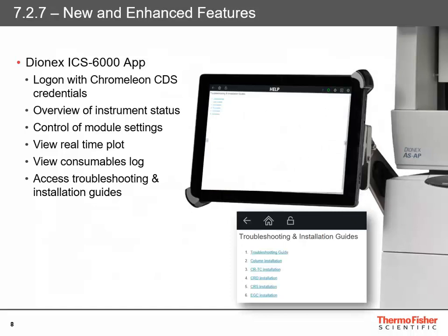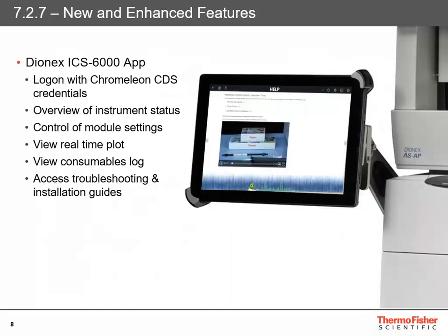It's a bit small on the screen above, so I enlarged it below. And you can see there are some links to, for example, column maintenance, column installation, installation of the different devices. And when you click on one of those links, you actually get access to a video which walks you through setting it all up and installing it correctly.